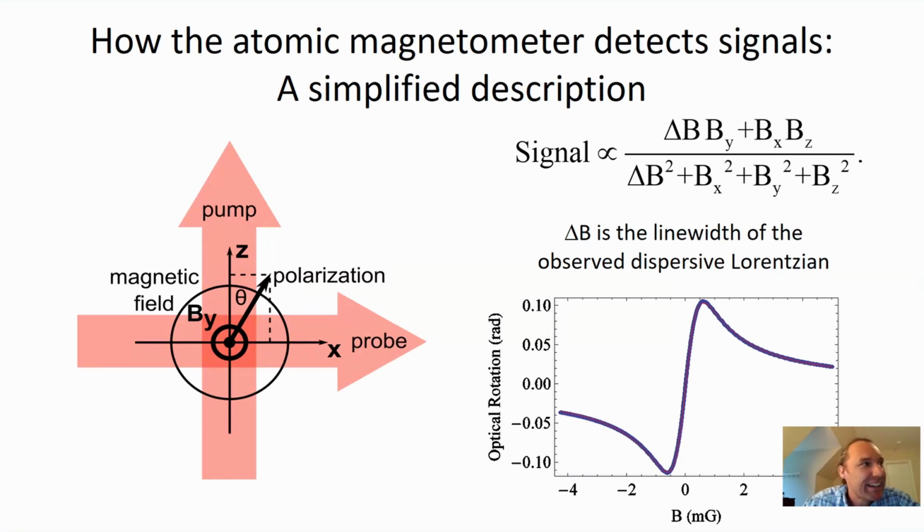I hope that the way that I have described the mechanism of operation makes it very logical as to why having a 90-degree angle makes a lot of sense here. Just by the mechanistics of it, you want to pump into the Z direction and then you measure the component into X by having a 90-degree angle. I feel like that makes a lot of sense.